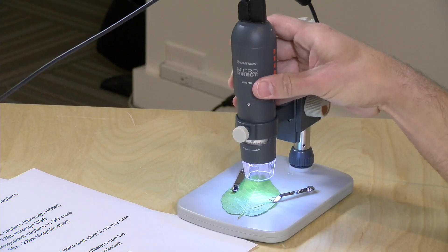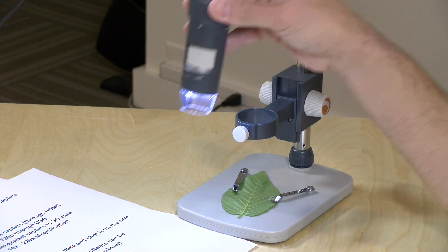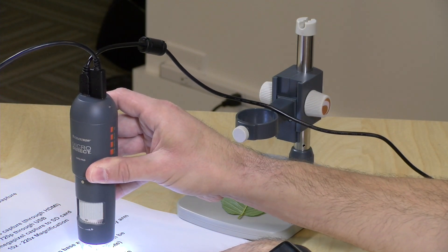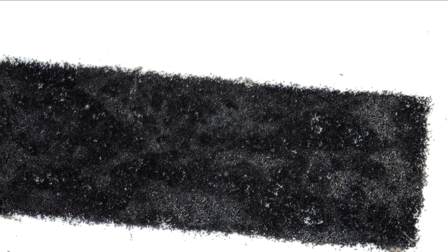You can also take the microscope out of its stand and use it handheld. So I've got some paper here from my laser printer that was printed out earlier and I can look at the letters very closely to see how the toner got distributed on the page. There's a lot of cool stuff you can do with this thing when you take it out of the stand. My daughter and I were looking at all sorts of stuff around the house with this as I was testing it.